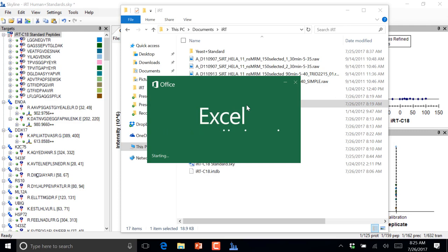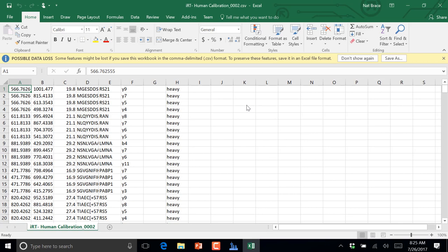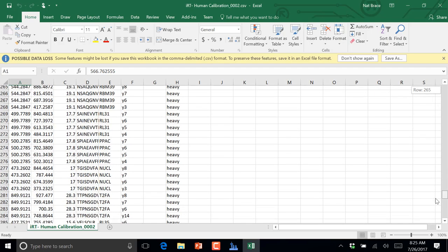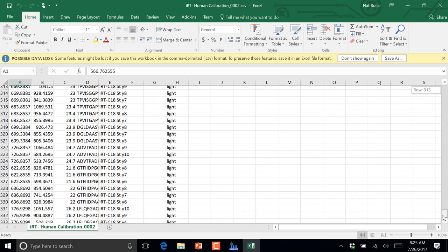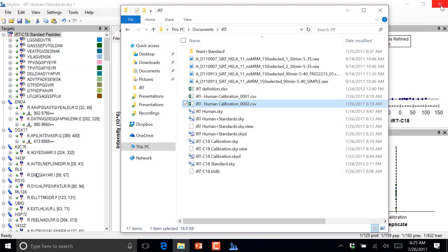And that's a property that most standards have. If you set up a QC standard or a global normalization standard, pretty much all standards always get put into your transition list or your isolation or inclusion list if you're doing PRM, because even if you do multiple files, you want to measure your standards in every one of them. So that's already set up for you in Skyline for this.